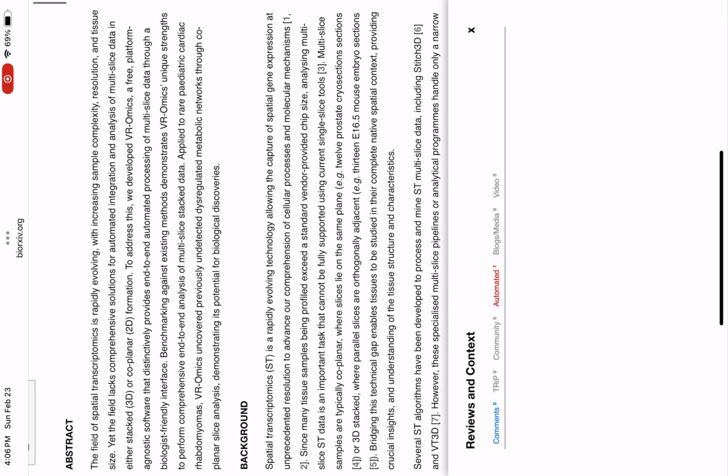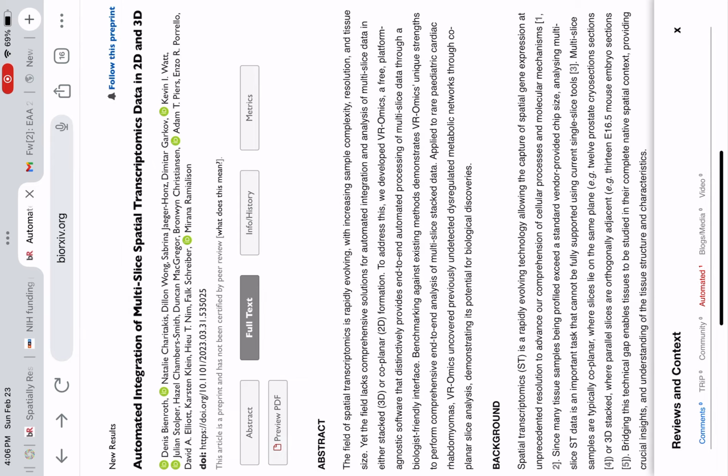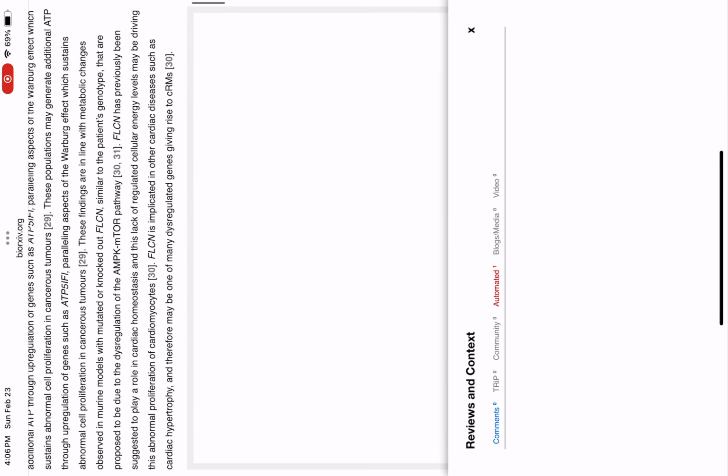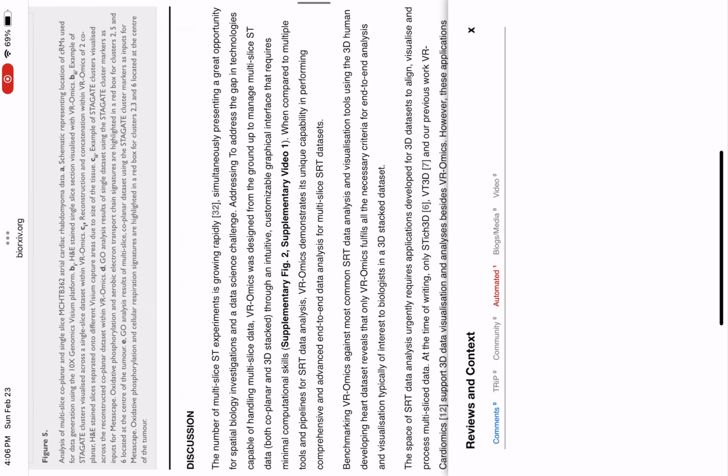35. This visualization aids in correlating disease severity with tissue characteristics, further enhanced by the superimposition of metadata like clustering results or images alongside gene expression data, allowing for rapid assessment of alignment between clustering, gene expression, and tissue histology. The platform also enables the exploration of gene expression profiles, crucial for leveraging the full potential of SRT data.